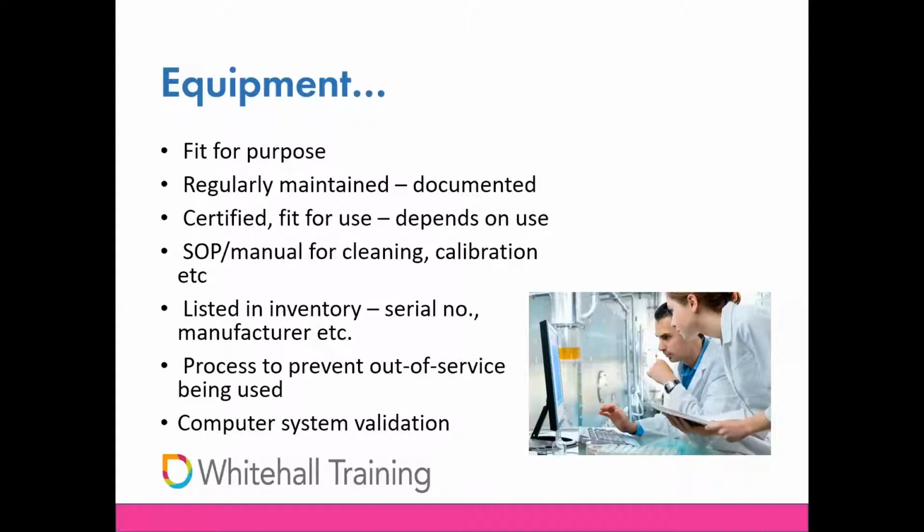A risk assessment can help with determining how often you need to do calibration. So ask yourself questions like, what's going to happen if an analyst discovers that equipment isn't working on a particular day? Will you be able to identify how many samples have been processed since the last time the equipment was checked? So how many samples could have been potentially affected? What impact is that going to have on the study? And how much will it cost to rerun all of the affected tests, not only in terms of money, but also in terms of potential damage to the lab's reputation?